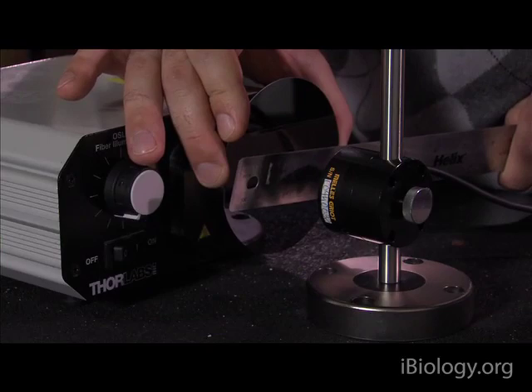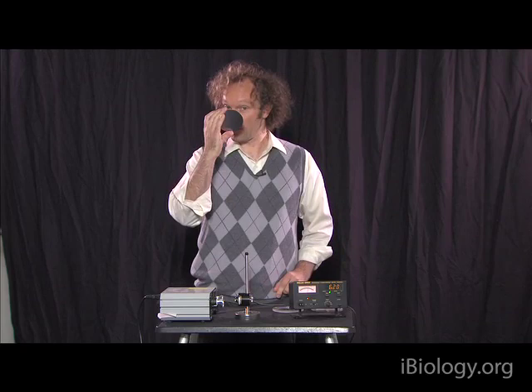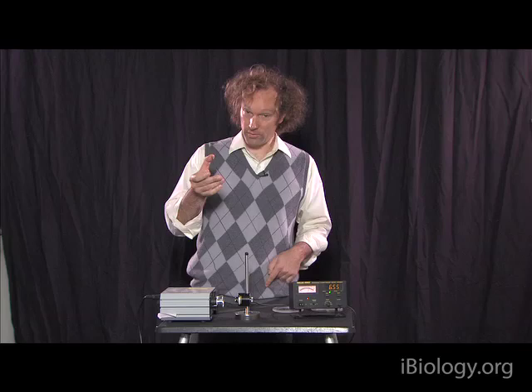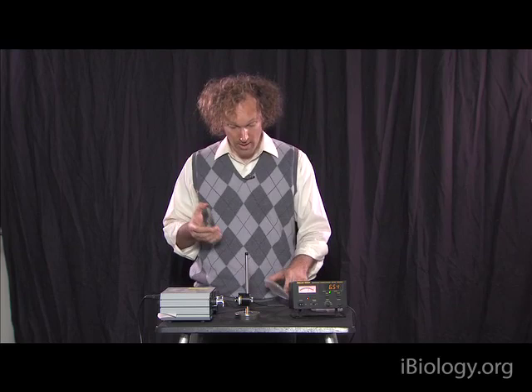So why is that? Well, it turns out that silicon, while it's opaque to our eye, is not opaque to the lamp. That's because the lamp, a halogen lamp, is producing infrared electromagnetic waves in addition to visible light. And that infrared, longer wavelength, lower energy, can transmit through silicon. As a result of the transmission, to an infrared wavelength, silicon appears like quartz does to our eye: transparent. And in fact, if you build an infrared microscope, some infrared microscopes use lenses made out of silicon.